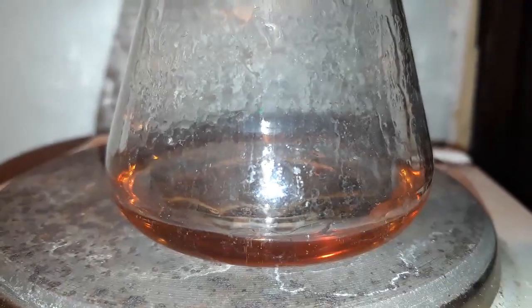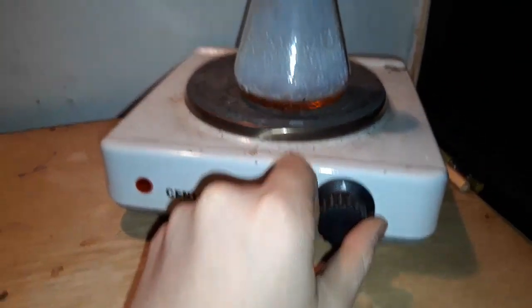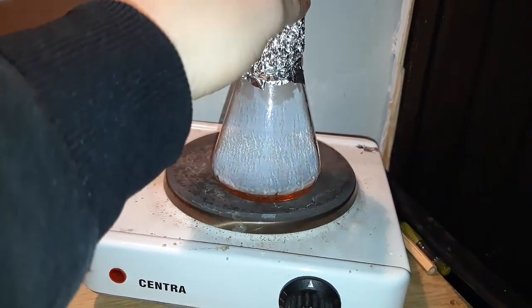After one hour, the reaction is still taking place. After two hours, we stop the heating and cool the flask down to room temperature.